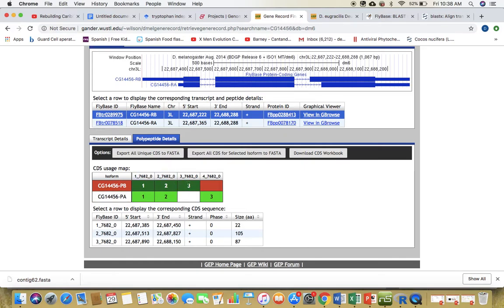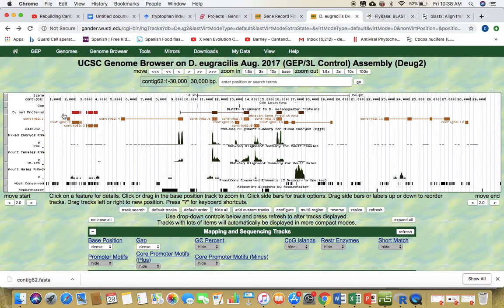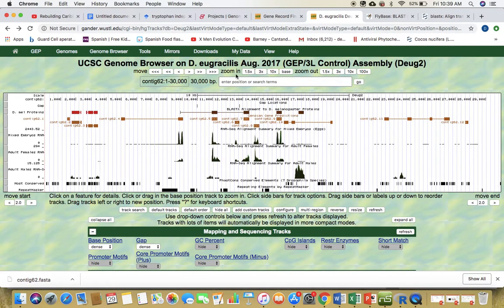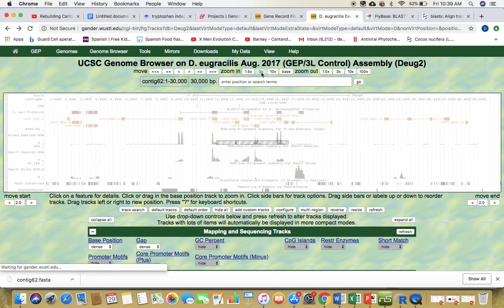And we have 3 to 4 exons. So our isoform is on this vertical axis here, and on our horizontal axis, we can actually see our exons. So I'm going to start with annotating my first exon on this. But before I even do that, let me show you something. Here, let's highlight this a little bit by clicking on it or zooming in x3.